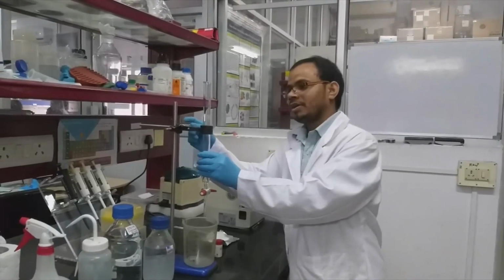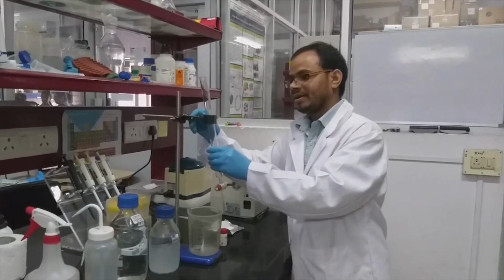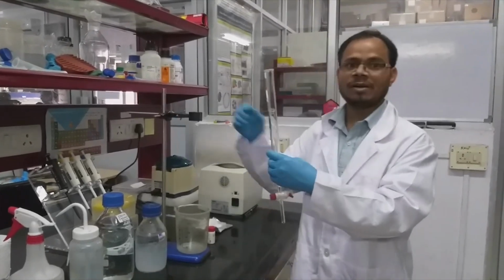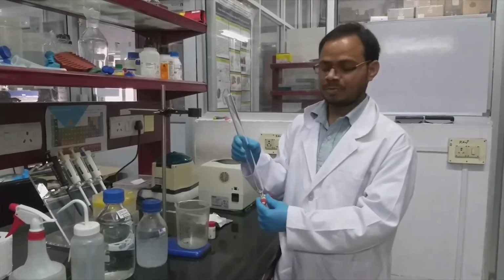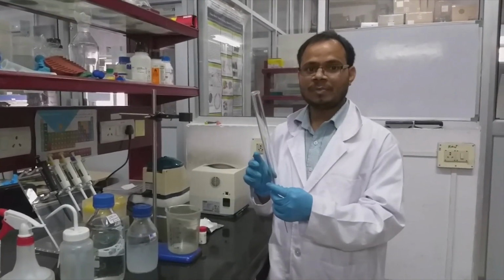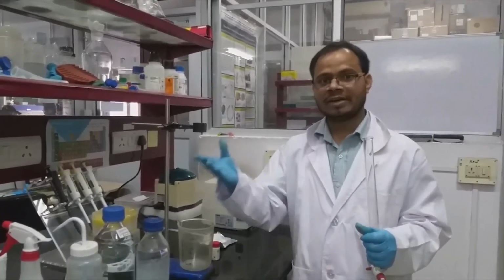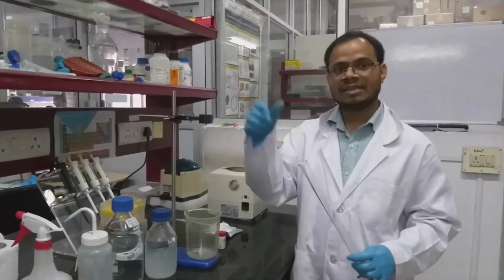For this chromatography we can use a burette or a column. This is one of the columns we are using in this experiment. For the resolution of molecules, if you are using 10 kDa, 20, 30, 40, 50 kDa proteins, you need to increase the length of the column.